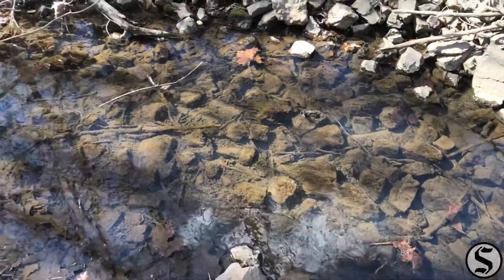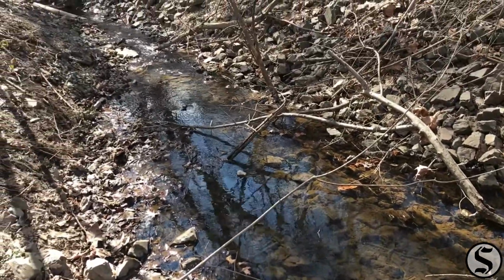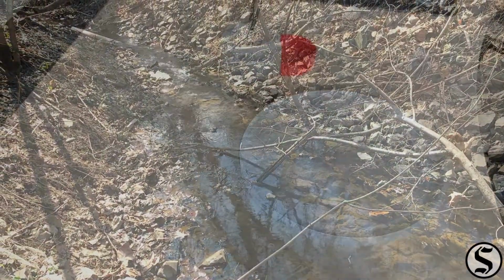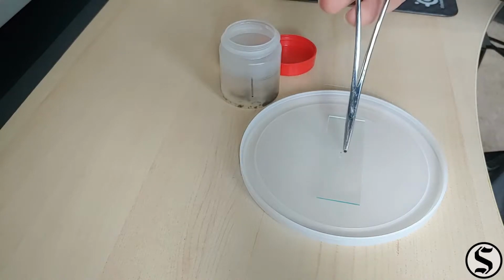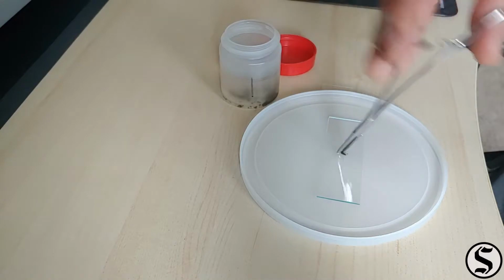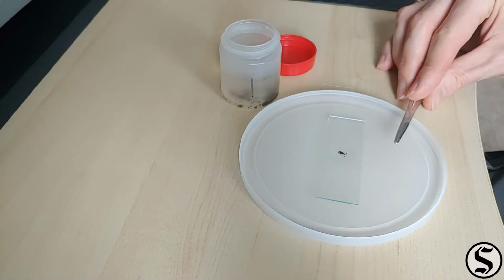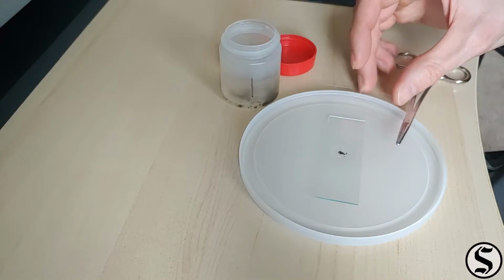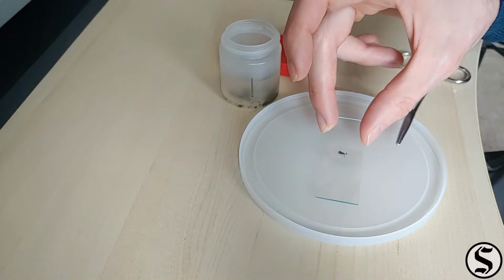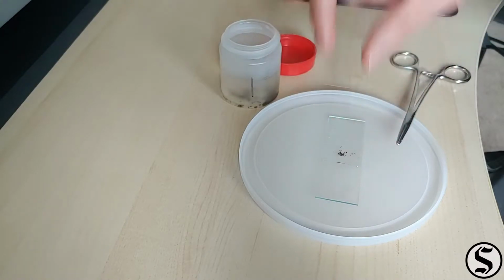Today's sample comes from this drainage ditch. There was an interesting brown sort of sludge on all of the rocks, and when you have a microscope, sometimes you want to investigate stuff like that. So I put a little onto a slide with some water and dropped on a cover slip. Well, let's find out what's in that stuff.